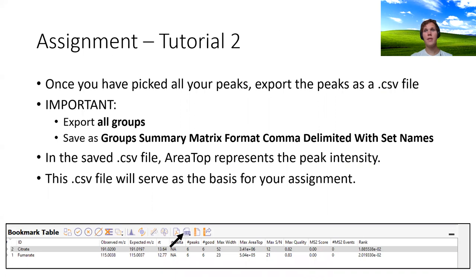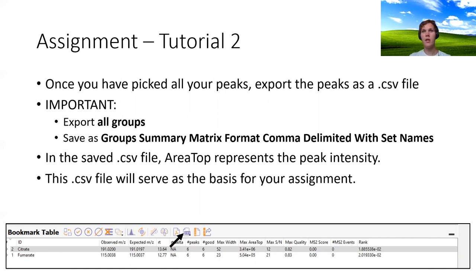Once you've picked all your peaks, export them as a CSV file by clicking the export button on the bookmarks table. Importantly, export all groups and save as a group summary matrix format, comma delimited with set names. If you save it in any other format, it won't come up properly. In the saved CSV file, Area Top will represent your peak intensity, and this CSV file will serve as the basis for your assignment.